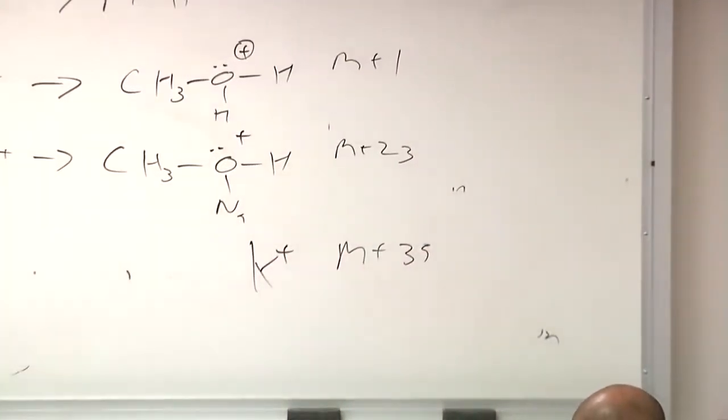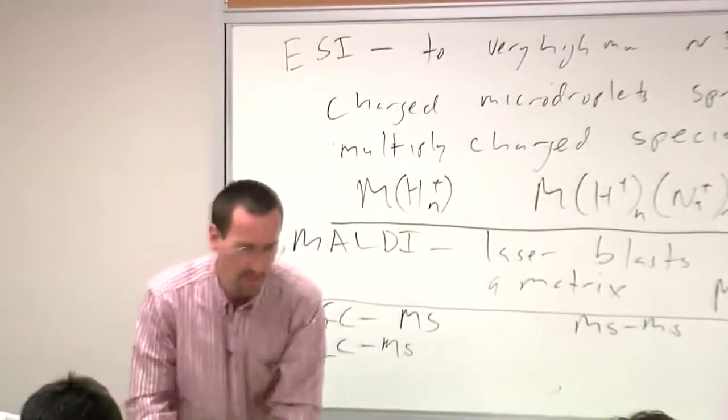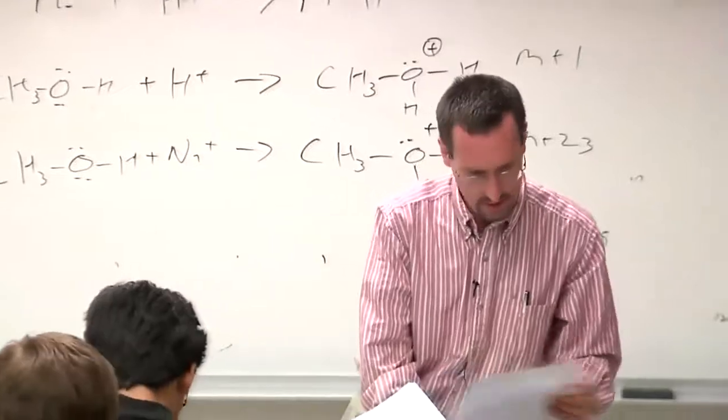And so what I want to do is show you an actual ESI mass spectrum of a molecule. I have a handout here.